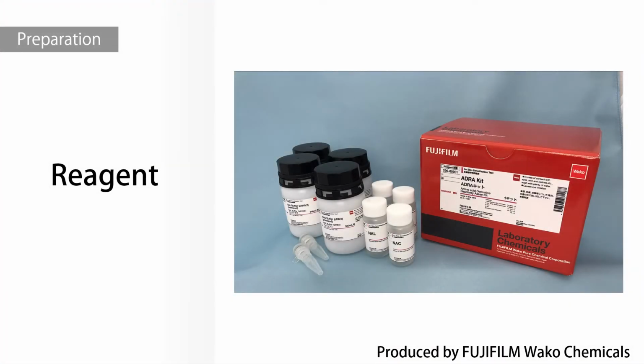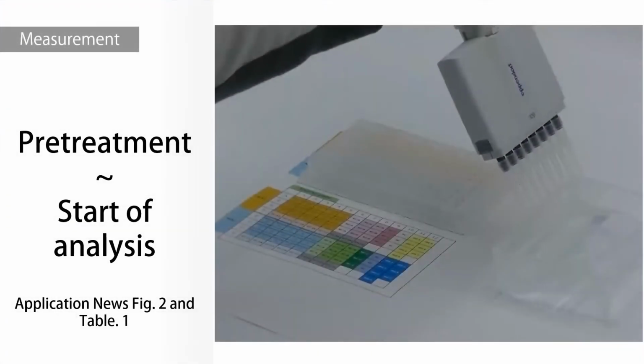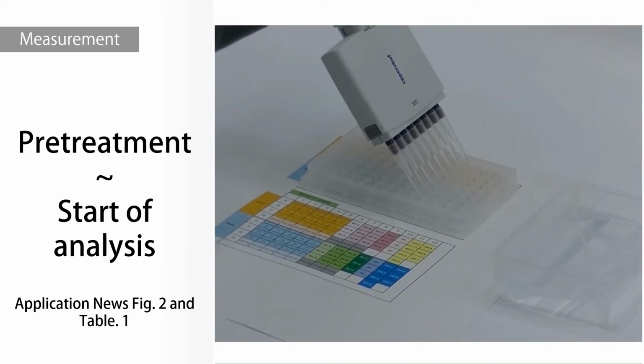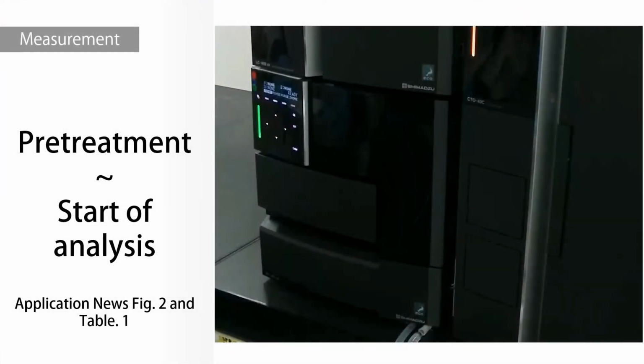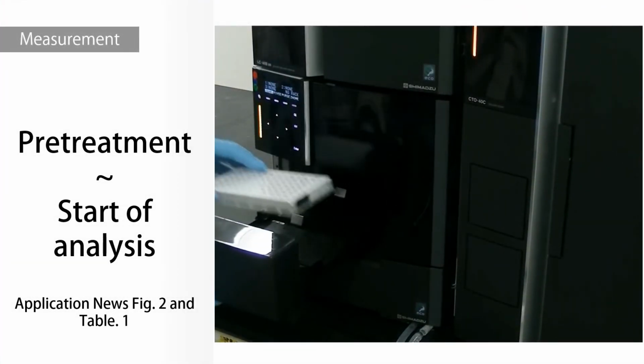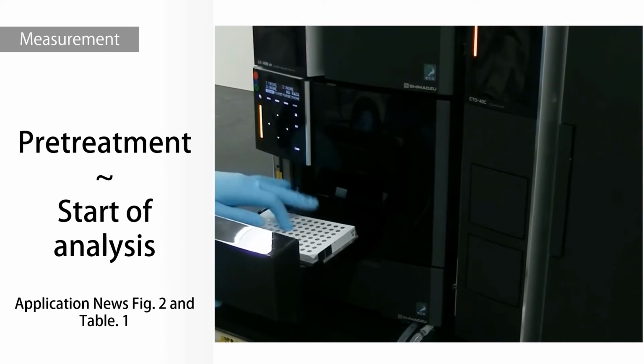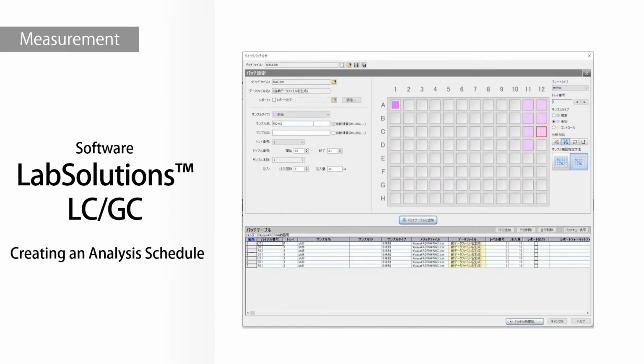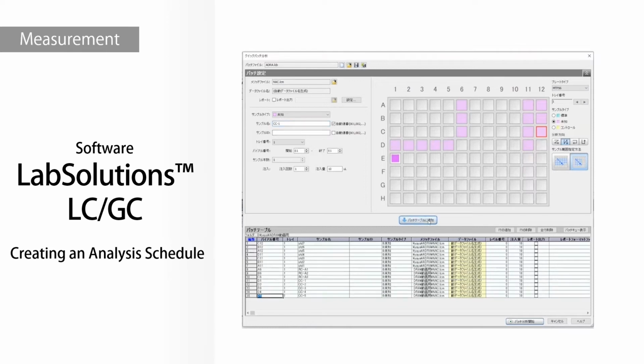For the reagent, we use this ADRA kit from Fujifilm Wako Chemicals. For the pretreatment, pour NAC, NAL solution and reagent solution into a 96 well microplate and mix. Incubate at 25 degrees Celsius for 24 hours. After incubation, add the stop solution and set the plate in the autosampler rack. With LabSolutions, it's simple to create an analysis schedule. This schedule is used to start the analysis. Now let's take a look at the results.